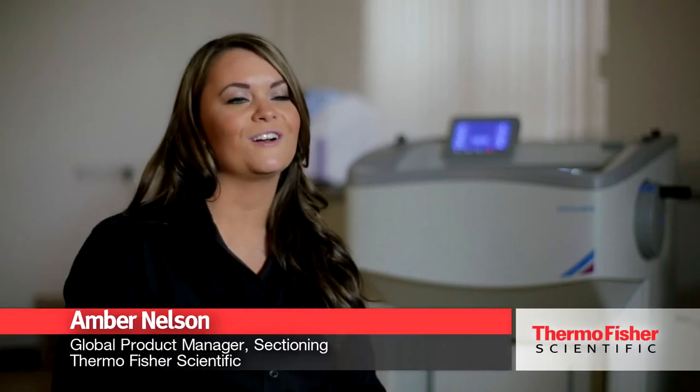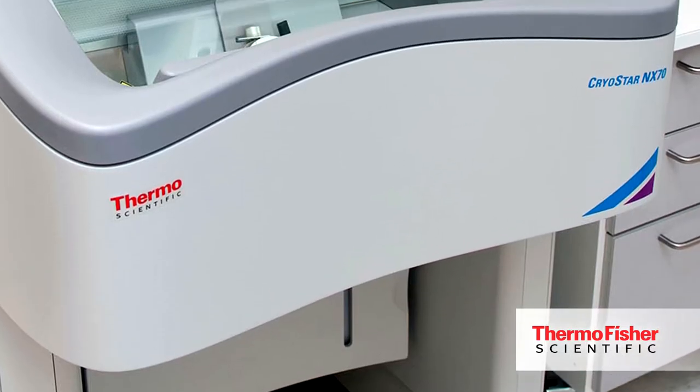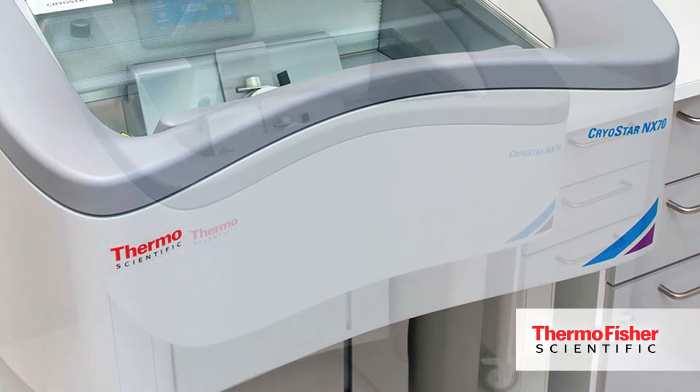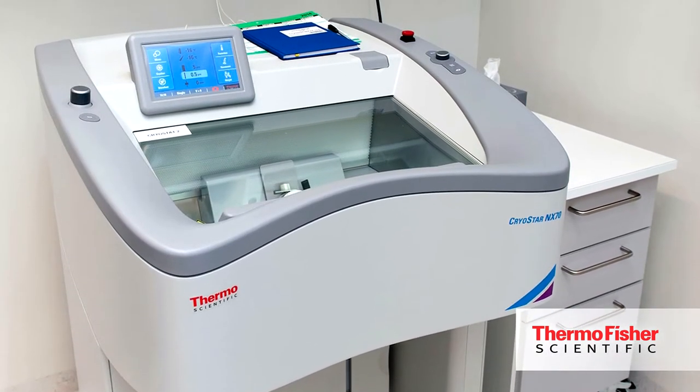Behind me here we have the Cryostar NX7D Cryostat — it's the latest in cryo sectioning. One thing you might notice is that this cryostat looks dramatically different than others you'll see on the market. What we've done is we've built this unit completely around the user to address all of our ergonomic concerns. We wanted to make it more comfortable, higher quality sectioning, and safer for them to use in their daily workflow.